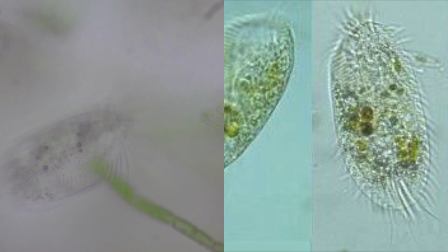Using 40 times magnification allowed a clearer view of the ciliate's characteristics. Due to the characteristics I've noted, I came to the conclusion it was in the family of oxytrichids. During my search, I encountered this photo provided by a database for identifying protists. I concluded the organism was a Stylonychia.